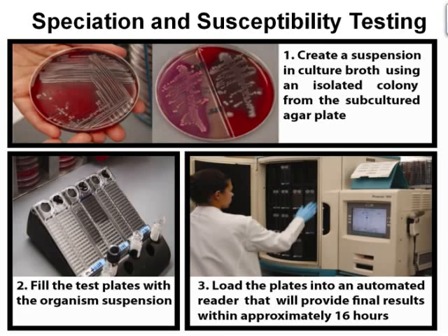On the right half of the plate we have sheep blood agar, and on the left MacConkey agar. MacConkey is a selective media for gram-negative enteric pathogens. In short, laboratorians are able to differentiate lactose versus non-lactose fermenting isolates with this media. We will expand on various agar types used for discriminating organisms later.